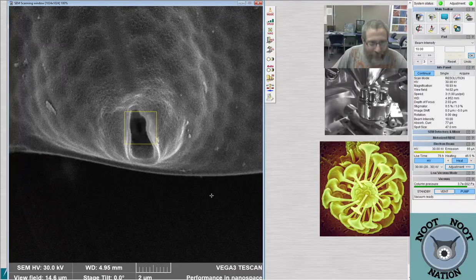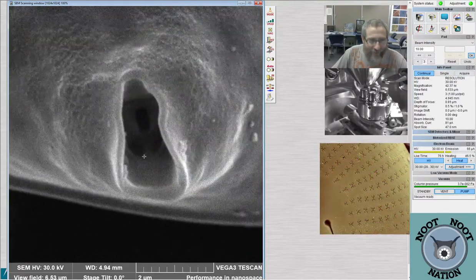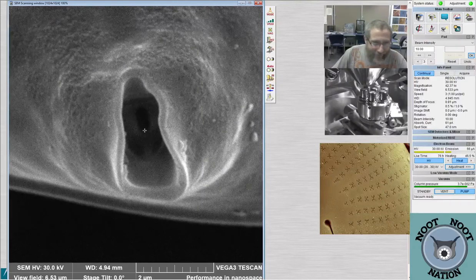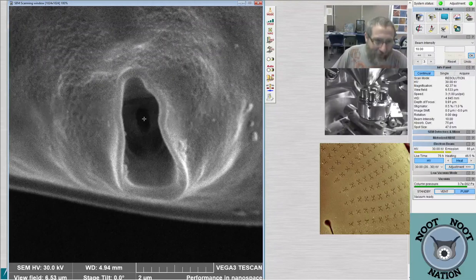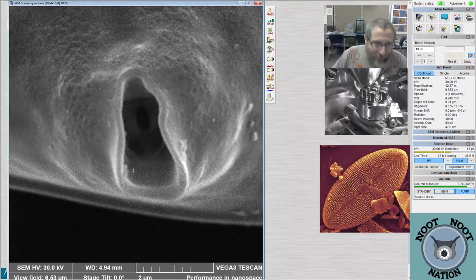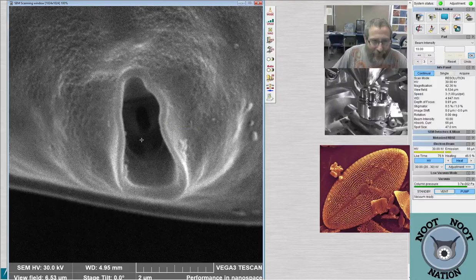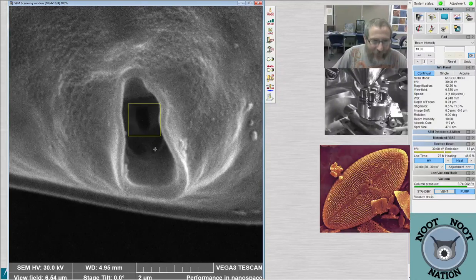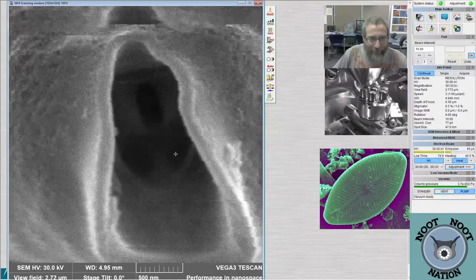And I'm going to do a little bit of exploring this tiny little hole. Oh, that is so cool. So that's on an Asteromphalus. That is Asteromphalus, and these are associated with the Rumiportula. So we're looking into the Rumiportula tube, which is pretty interesting. That is amazing. We're looking right down into the tube itself in here, and we could get a little closer.